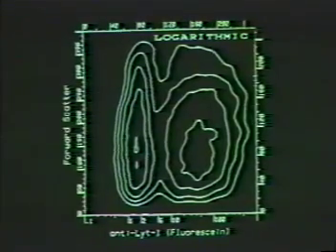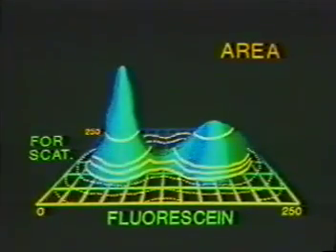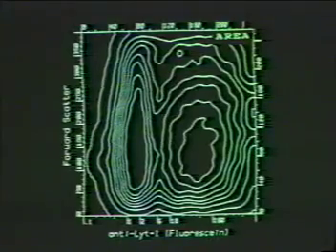These maps tend to place many contours around the low lands of a data landscape, so they can be useful for revealing small subpopulations. The area method of drawing contours divides the base of the landscape into concentric regions of equal surface area. In this example, 10% of the area of the map is contained between each pair of contours. These maps tend to heavily emphasize the low lands of a landscape, so that the peaks are effectively lost.